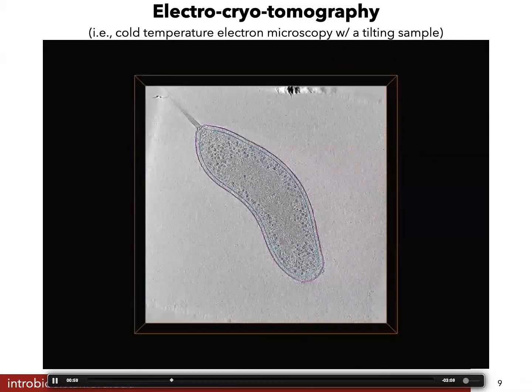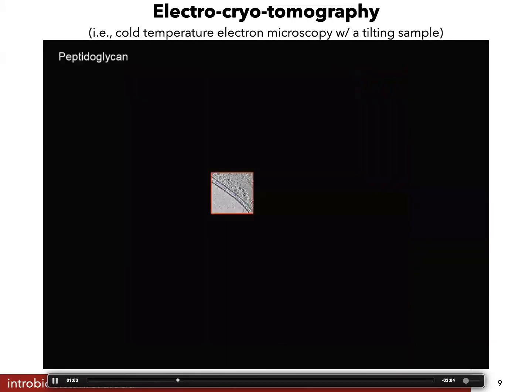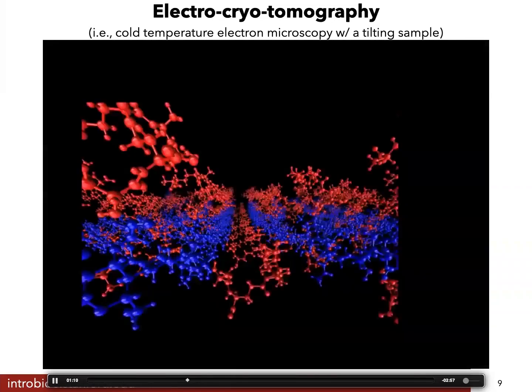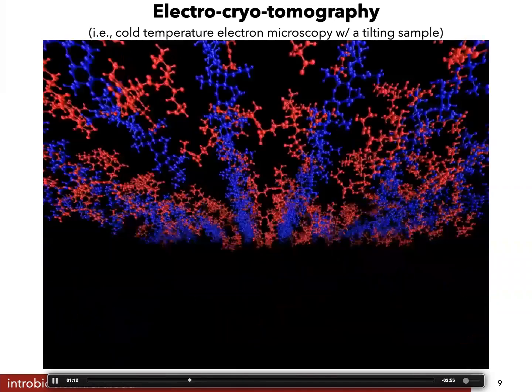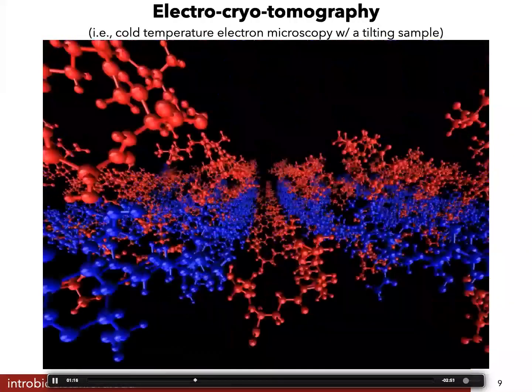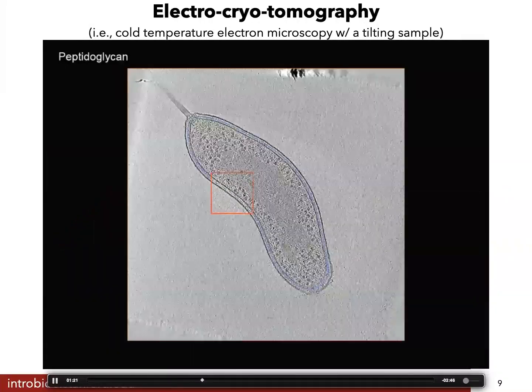Remember, this is an electron microscope that's got resolution between nuclei and molecules. And so, if you just look at the image, it looks kind of grainy, but we're going to zoom in and pick up on the detailed resolution of the microscope, right? So within this membrane, we've got some peptidoglycan, right? We've got these structures of atoms that are part of the membrane system surrounding the cell.